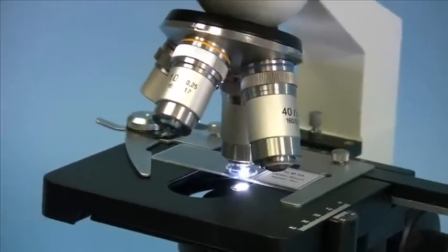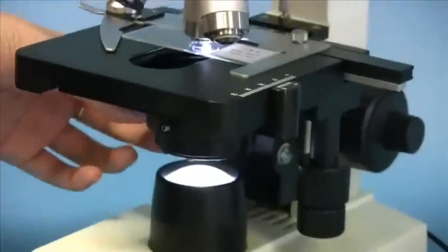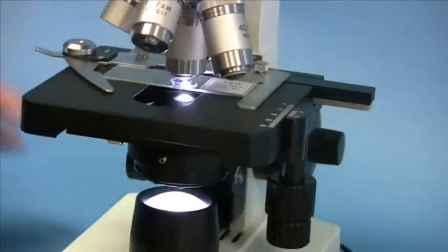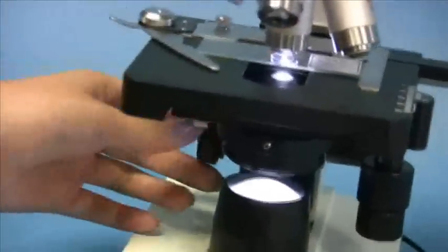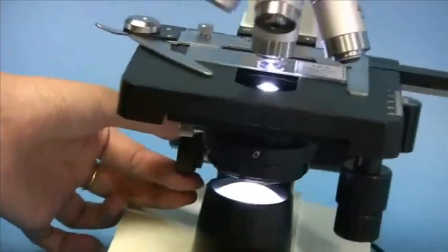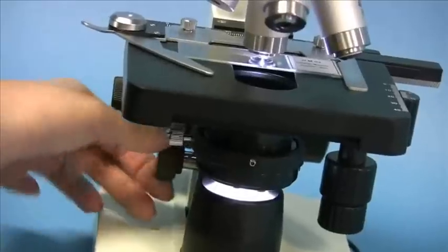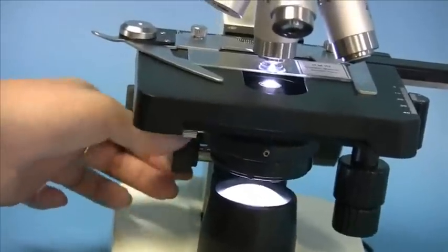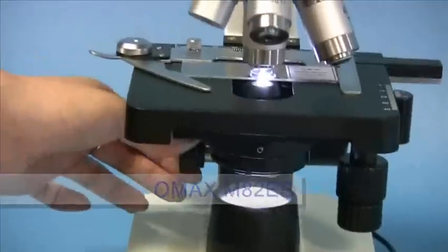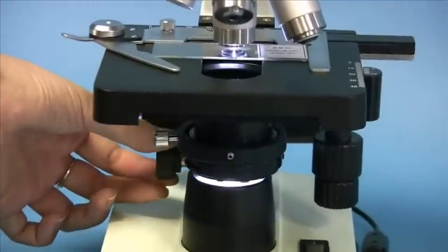In order to get the optimum conditions for your observation, you can also adjust the condenser and move it up or down depending on the objectives you're using. So if you're using higher power objectives, you should raise the condenser and lower it when using the 10x objective.